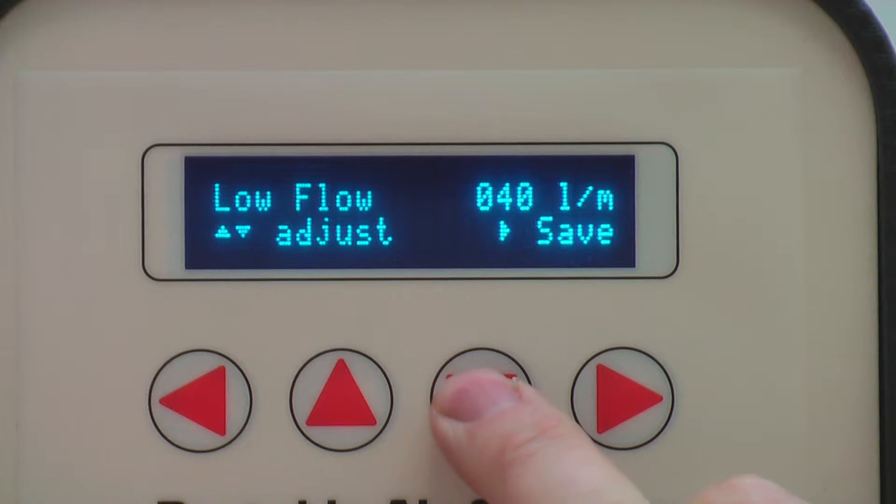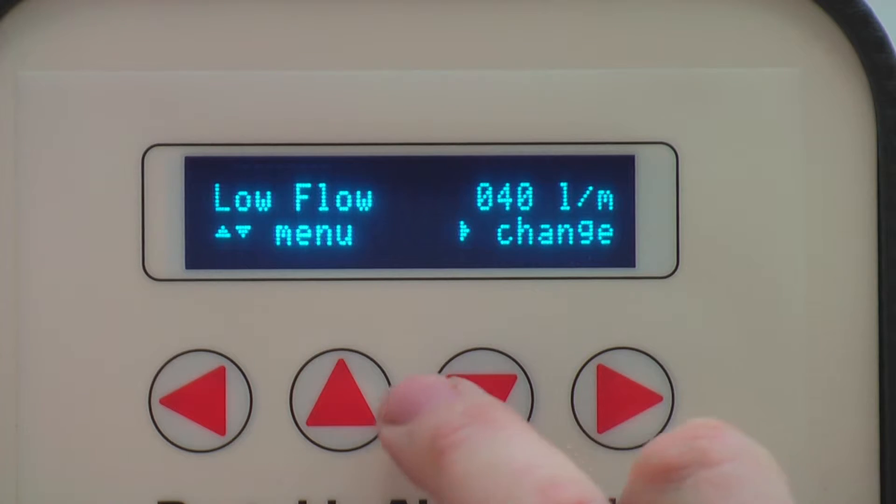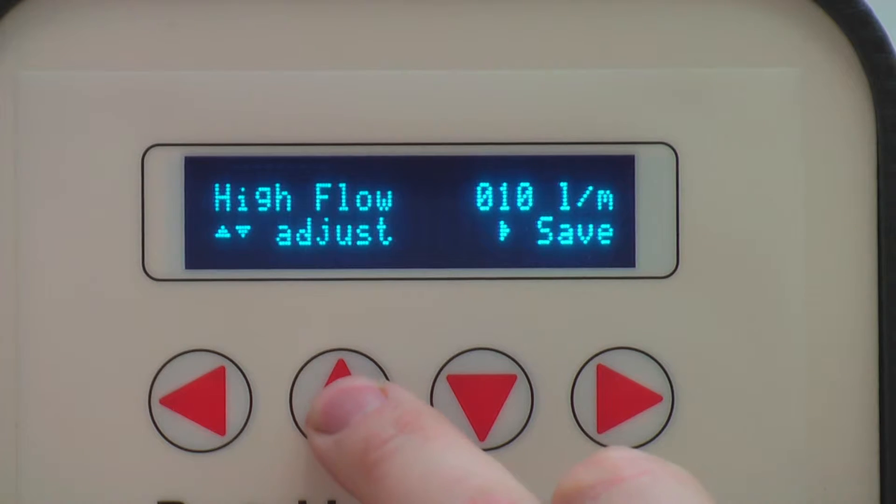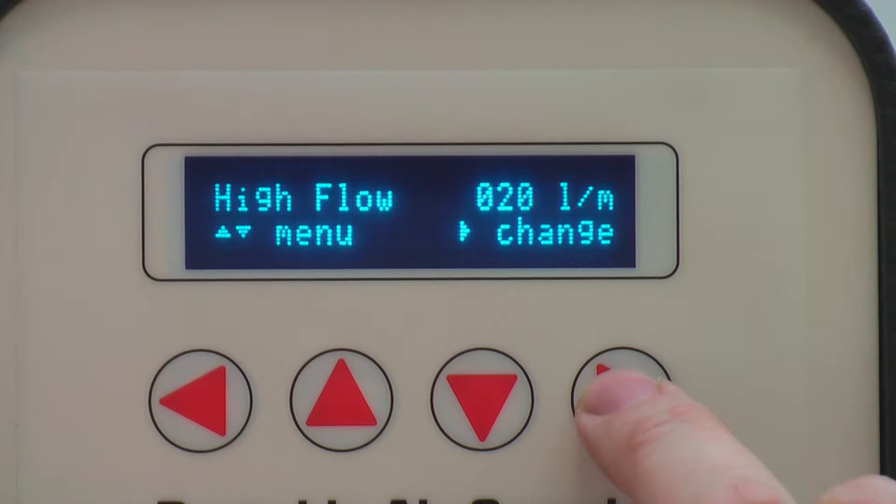When happy with your flow, press right again to save your new flow rate. Pressing down will take you to the high flow settings. This is the maximum flow which can be recorded before an alarm will sound. As before, pressing right will allow you to change the flow rates and you can increase or decrease the flow set point by pressing up or down arrows respectively. Save by pressing the right arrow key.